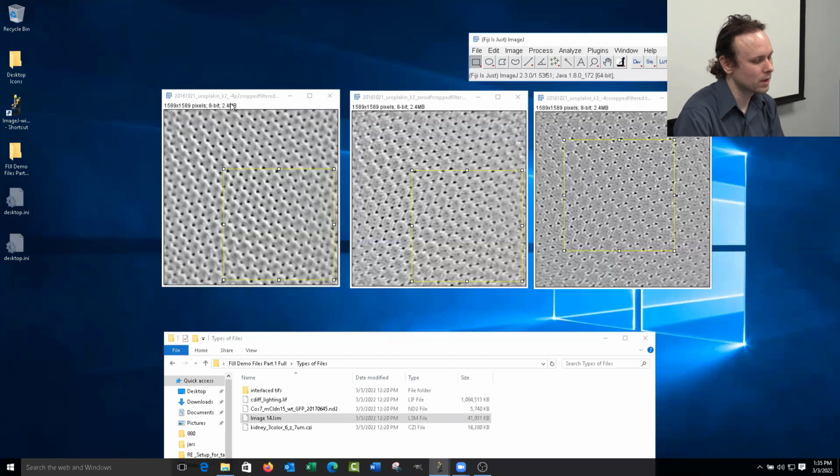Yeah, so for that specific, I use it a lot for this. It depends on the resolution of the original image you got. So if you have the pixels available, you can definitely do it that way. I primarily do electron microscopy, and so we do a lot of tiling. And from the tile data, we actually can produce really low mag work. And then we actually just end up doing this duplication function to show our high mag insets, because we have lots of pixels available in that case.